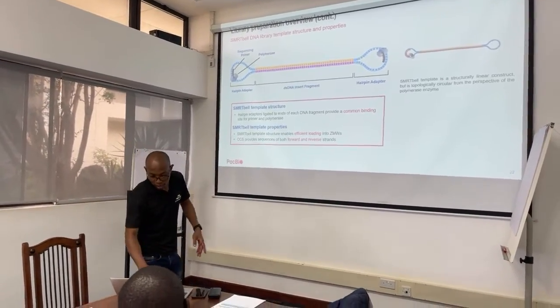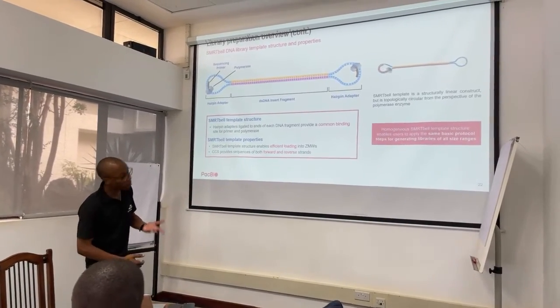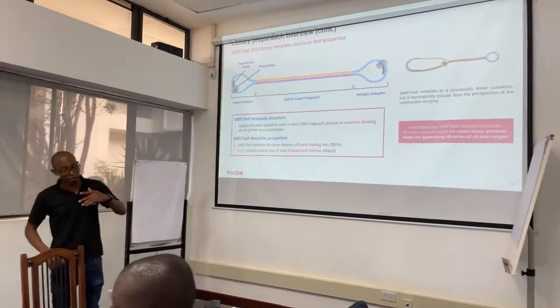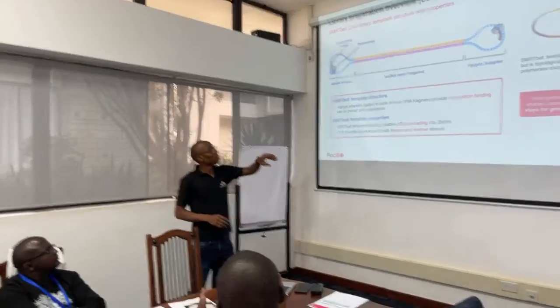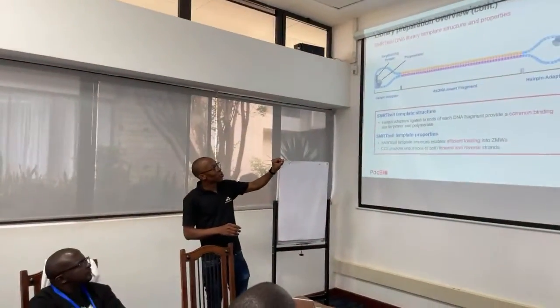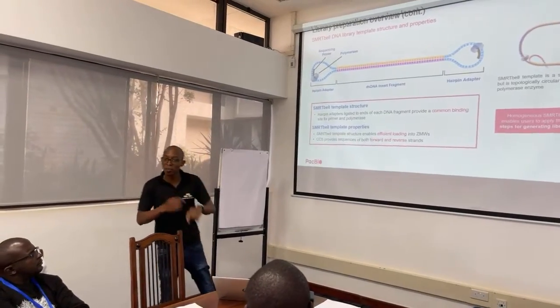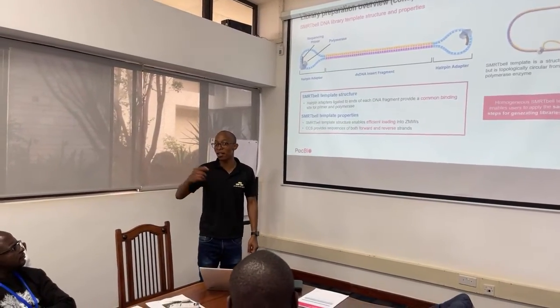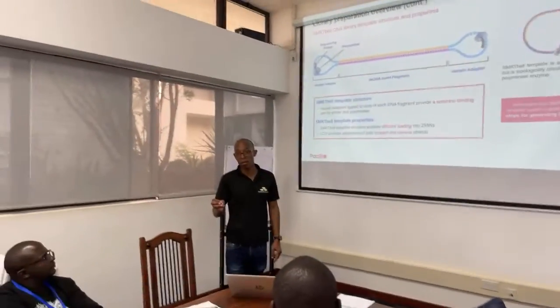And then of course, as I mentioned yesterday, the sequencing is a thing of beauty really. Once the machine starts sequencing, the polymerase will go around the molecule, and once it starts to displace the first strand, we call it the strand displacement mode. That's where the polymerase is at its best.